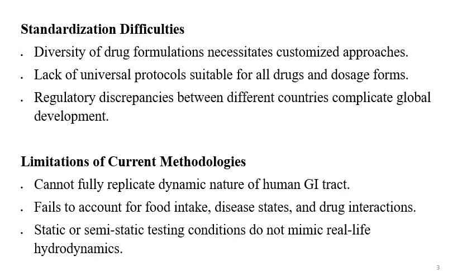So the formulation or drug molecule gets exposed to different pH environments at intervals during the drug absorption and dissolution process. That is difficult to simulate.